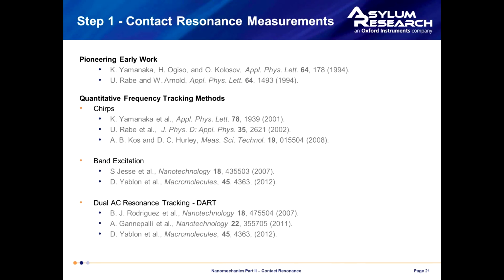Thanks, Donna. If you're interested in the history of this technique, contact resonance, the earliest pioneers were the Yamanaka and Arnold groups in Japan and Germany, respectively, back in 1994. These papers are definitely worth reading.